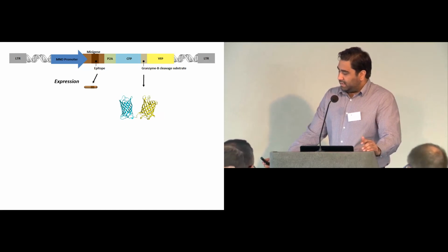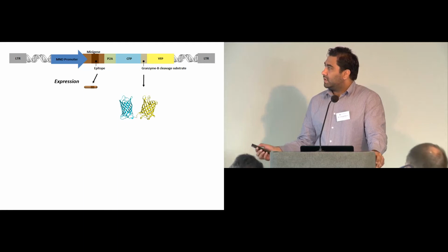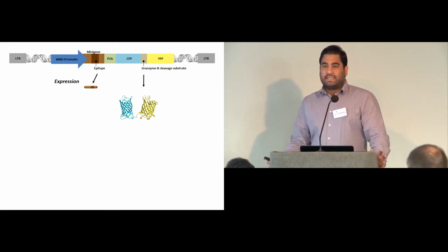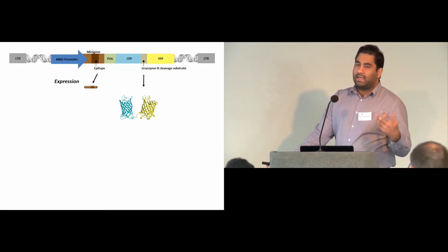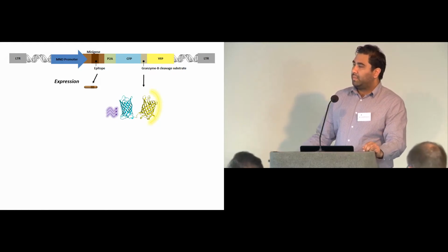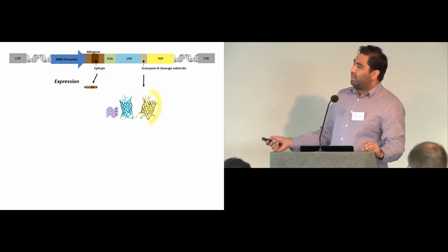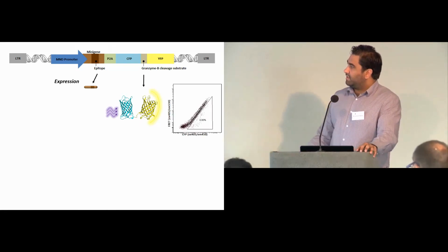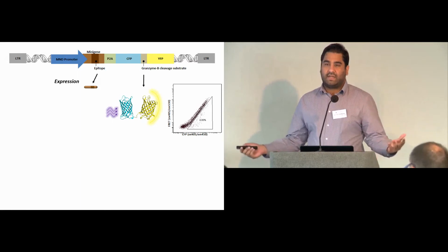You see the short peptide coding sequence here, and then also the intact reporter. And if we look at cells that are expressing this intact reporter protein, we can interrogate them with a violet laser, and we see that instead of getting CFP signal that you might expect off the CFP part of the molecule, we get FRET transfer of that energy over to the YFP moiety, and we get yellow light off of this reporter molecule. And we can monitor this in FACS. If we plot FRET versus CFP signal, we get a resting FRET signature in the transduced target cells.